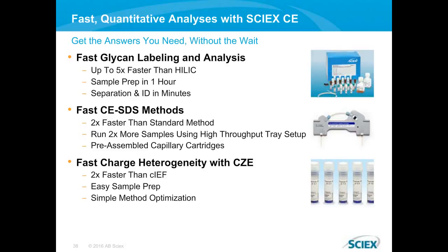It's going to be similar. It will actually be in about half of the time that you're able to get results, if you're using the long side currently of the capillary. There may be a slight decrease in resolution between some of the very, very closely migrating peaks, but you should not see a significant decrease in quality of data. In terms of reproducibility, you shouldn't see a difference there at all.